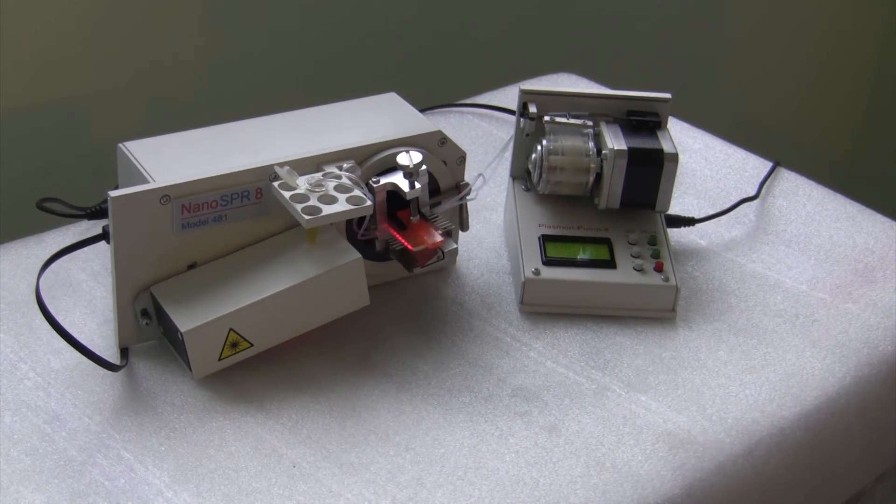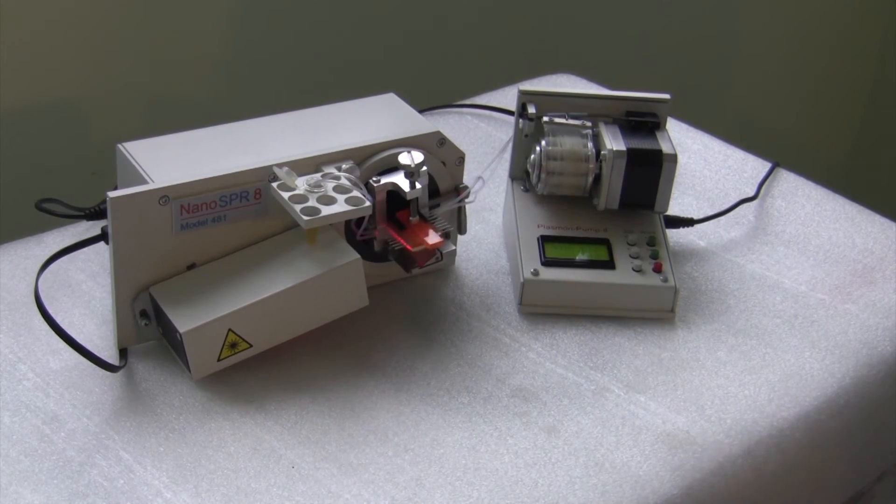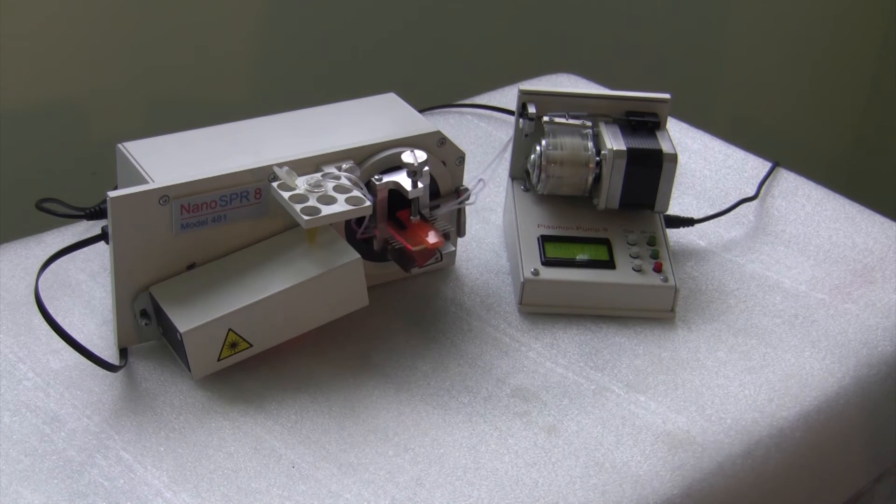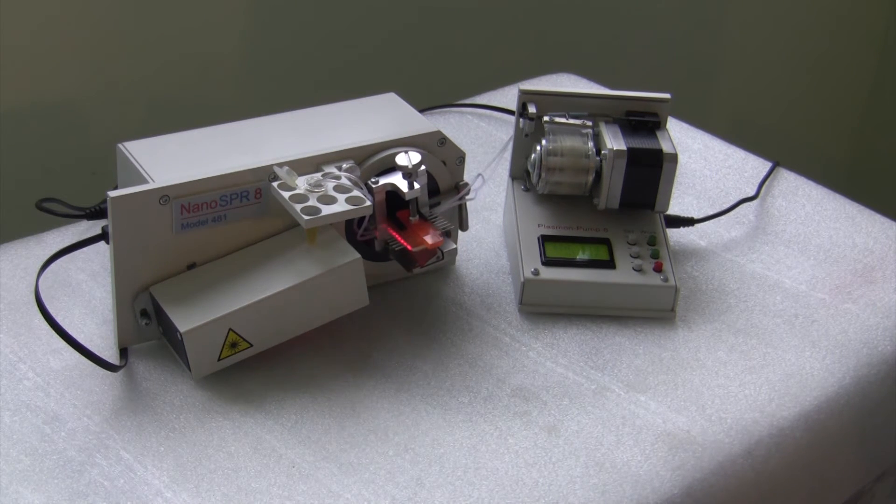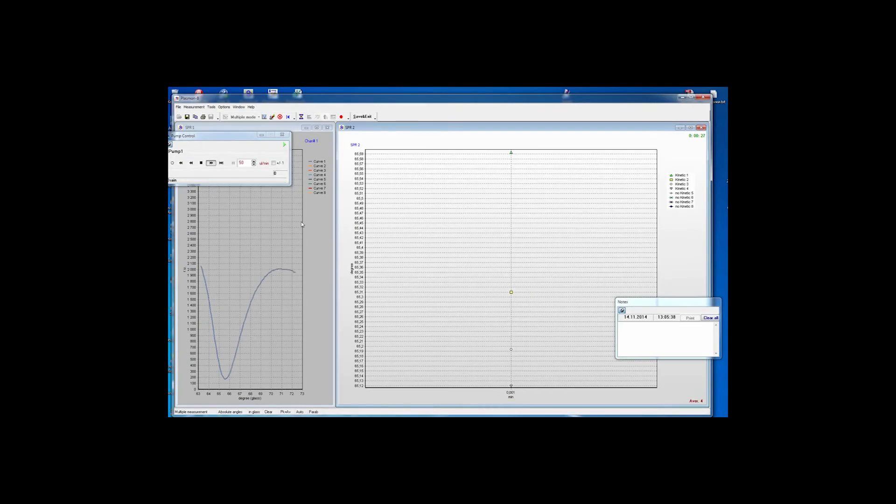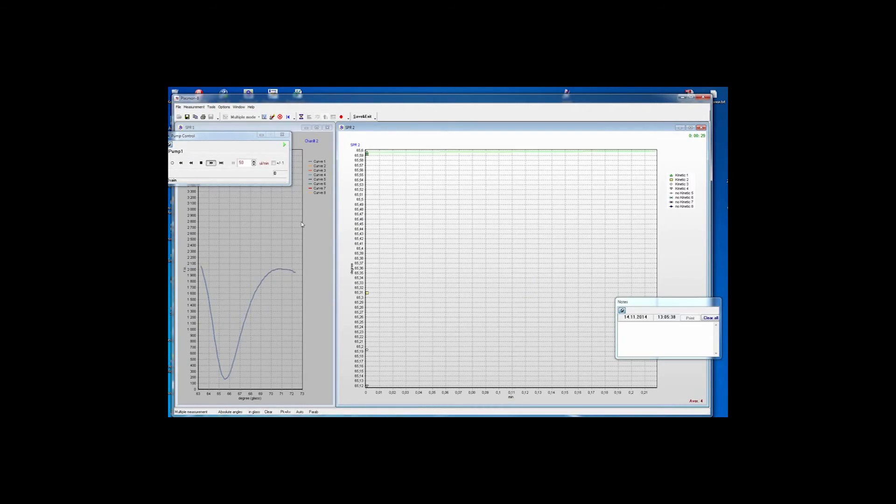In multiple mode of operation, we can measure sequentially a series of full curves. The maximal scanning range is 16 degrees. In device software, a left side window shows full curves for each measurement channel, right side kinetics.